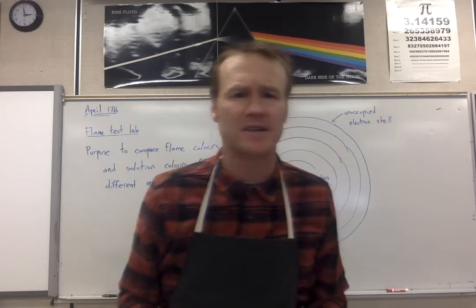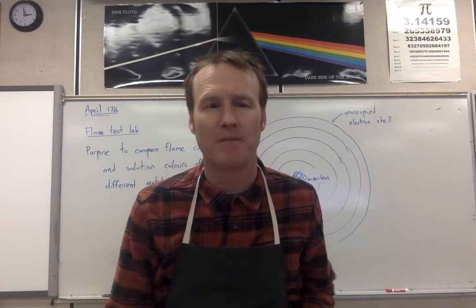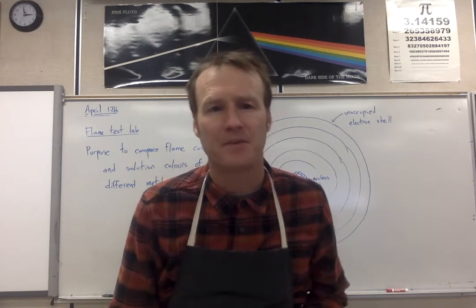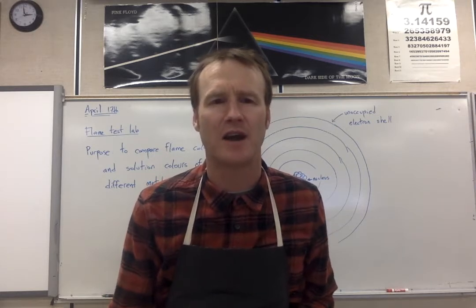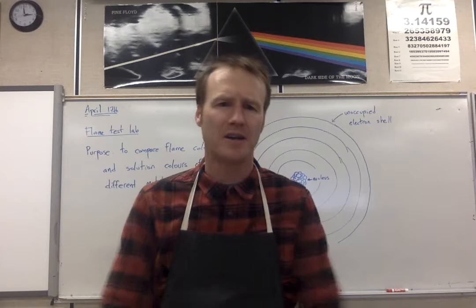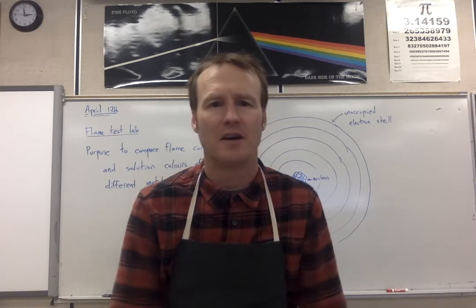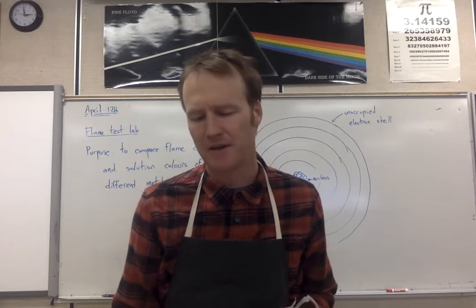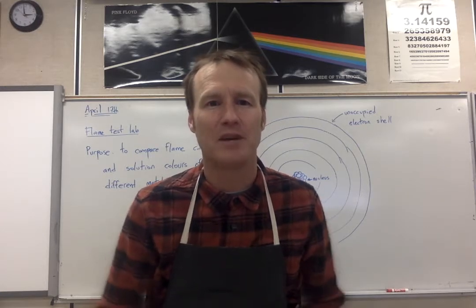That's the Flame Test Lab. I gave it the title, How to Make Fireworks Step 1. The reason for that is because you're going to see how to give a color to a flame. You can buy kits in like Canadian Tire, that kind of thing, around summertime that have substances that you can add to a flame that will give the flame a color.